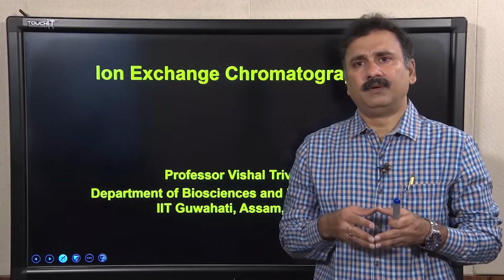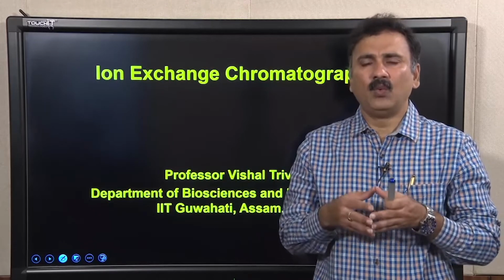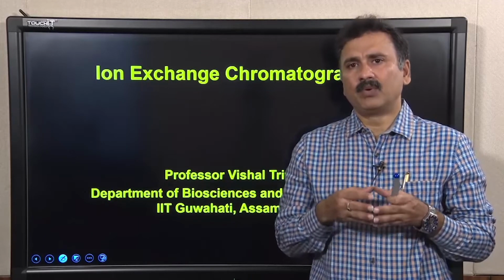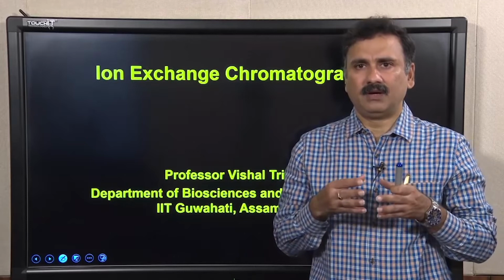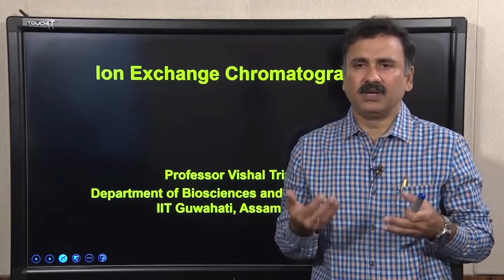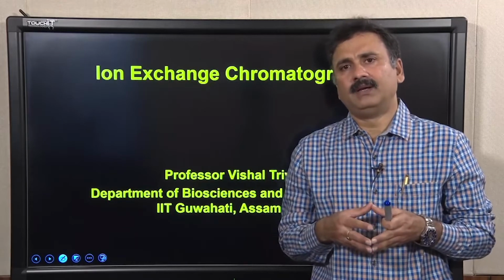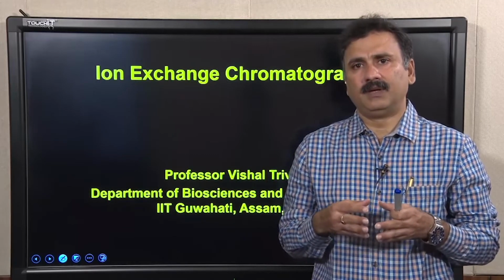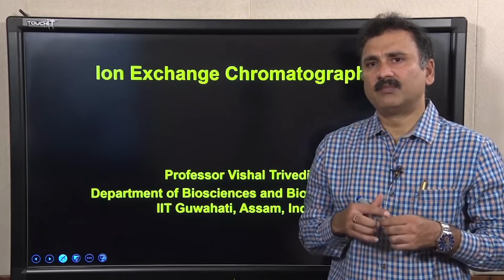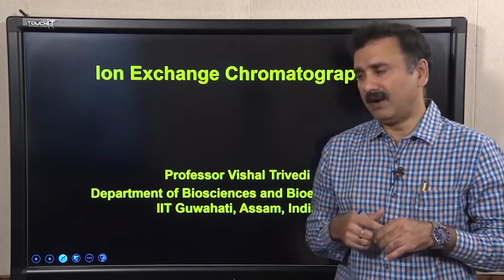So, why and how can we exploit the different chromatography techniques? Because the protein that we are going to purify in this course has different properties. So, let us see what different properties a typical protein molecule will have.